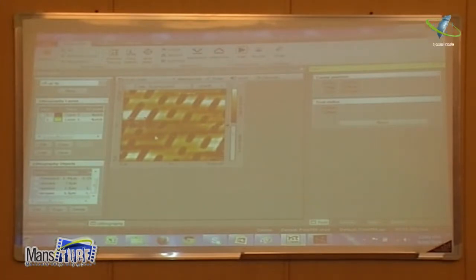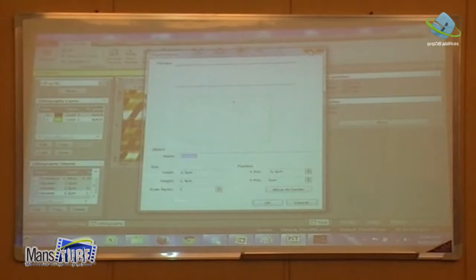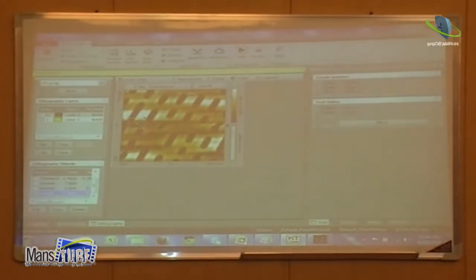And this position should be 2.5, and then I will make edit. Wait a minute. I think I can take it like that. Okay. So I move it. Okay, move it with the mouse.